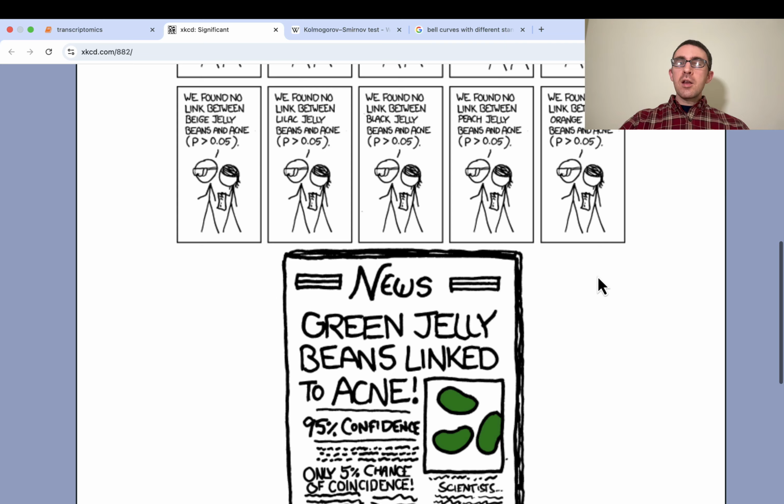So this is really the key part of the analysis, just taking what we've already done and going through and doing it for every gene that we're going to be testing. So we can go ahead and run this now. Okay, now we're almost done with this analysis. One more thing we need to do though, before we get to actually checking the results.